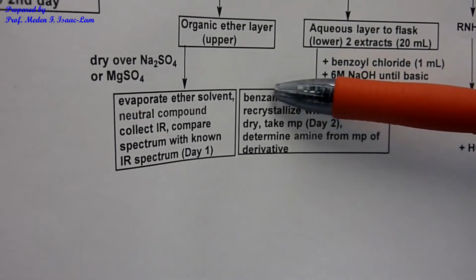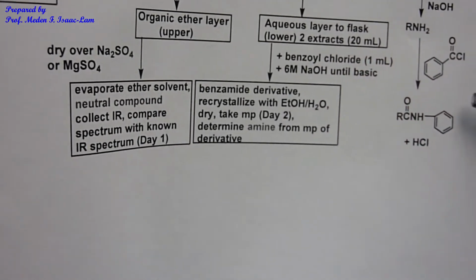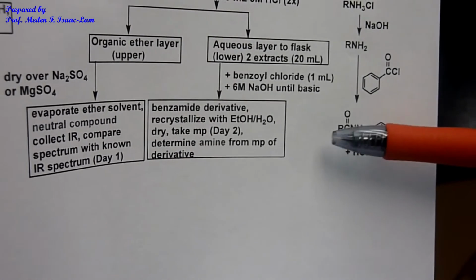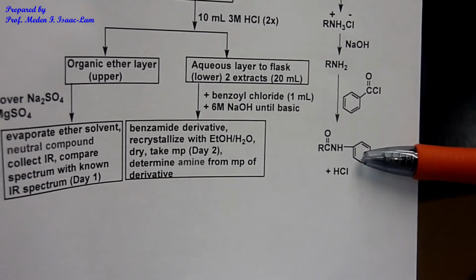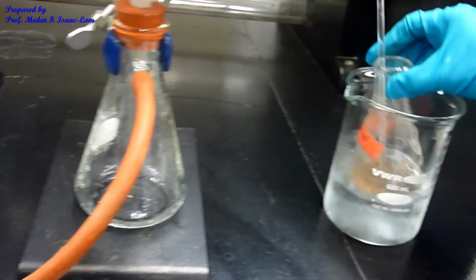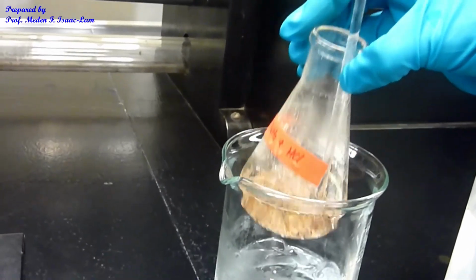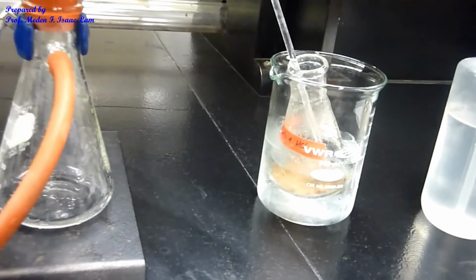We are now in this box at the bottom of the schematic diagram and in the flow chart. I remade this molecule, and we are now going to isolate the product. It's a solid, a derivative. The functional group is called an amide. This is now the product, and I chilled it in ice water. So I'm now going to filter this precipitate, the same process as earlier.